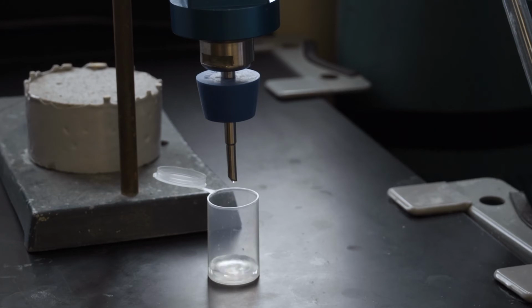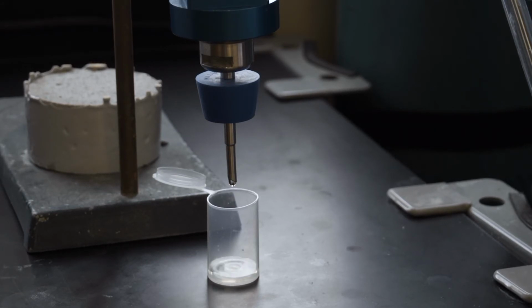The results from the previous calculations should yield the ionic concentrations of the main 5 ions in cementitious pore solution and the calculated electrical resistivity of the pore solution.